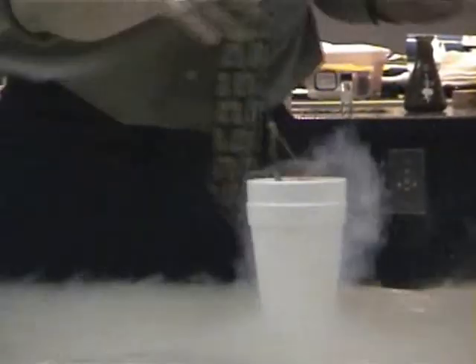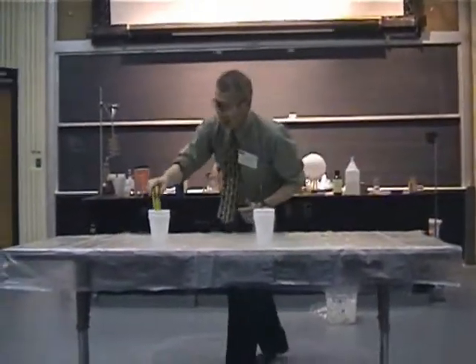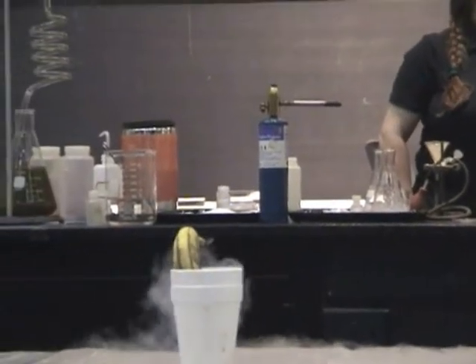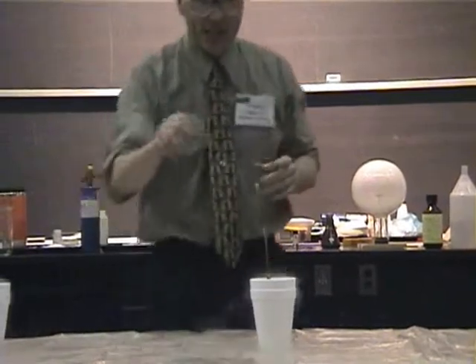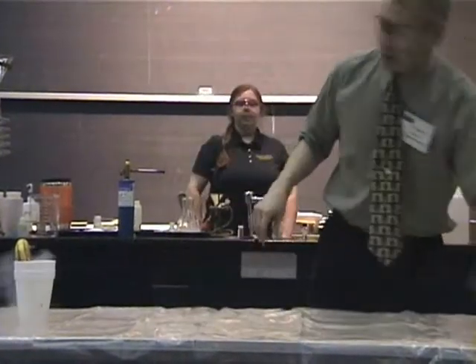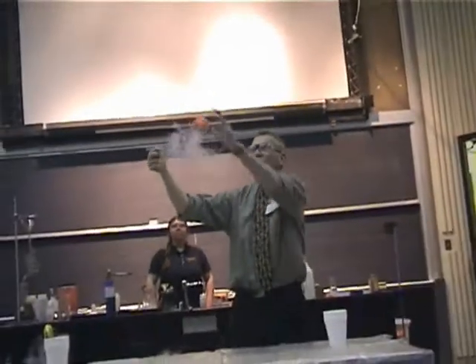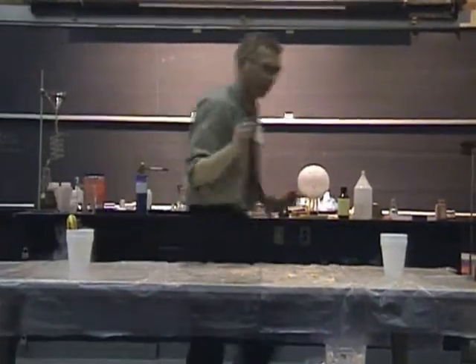We're going to see what happens when some things which are used to being at room temperature accidentally fall into minus 196 degrees Celsius liquid nitrogen — like your standard carnation. What do you think it's going to look like? I'm going to take my carnation and allow it to get cold. You can see it's still boiling, which means the carnation hasn't reached the temperature of liquid nitrogen yet. When I pull it out — my carnation is the same, with one notable difference: it's now frozen solid. Anything that contains water at minus 196 degrees Celsius is going to be frozen solid.